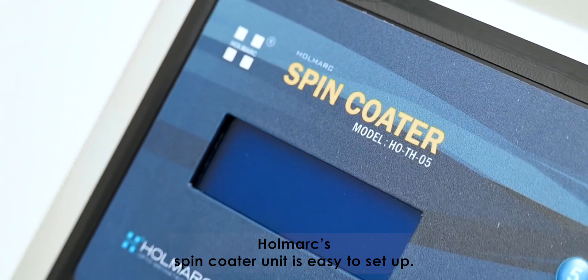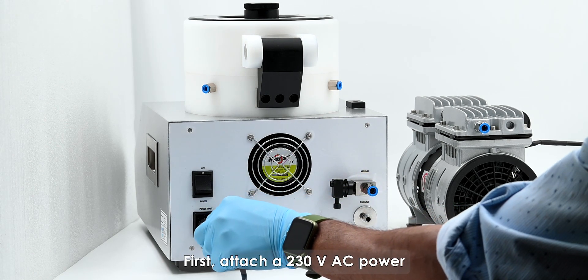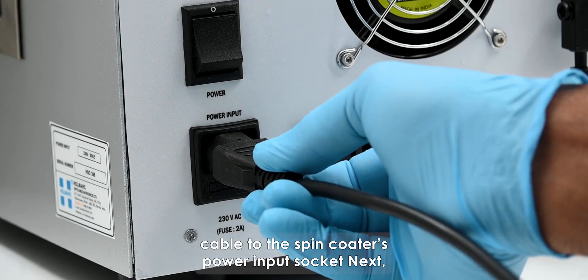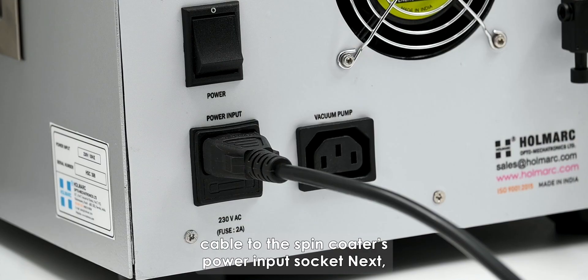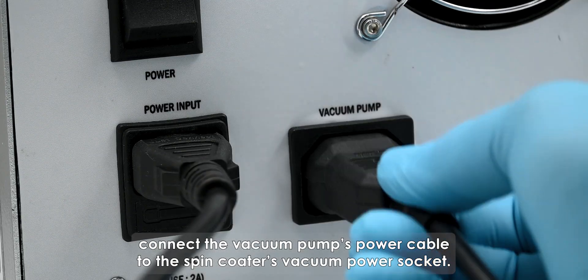Holmarc's spin coater unit is easy to set up. First, attach a 230 volt AC power cable to the spin coater's power input socket. Next, connect the vacuum pump's power cable to the spin coater's vacuum power socket.